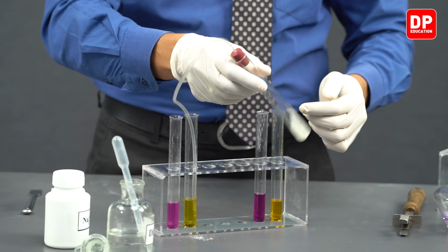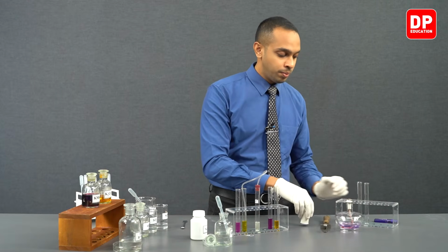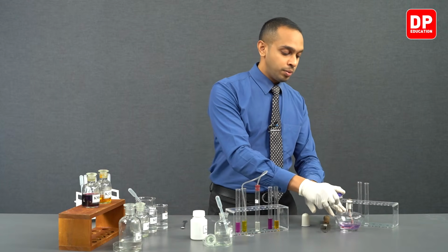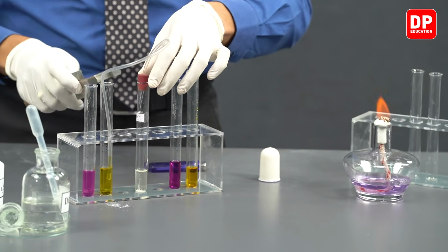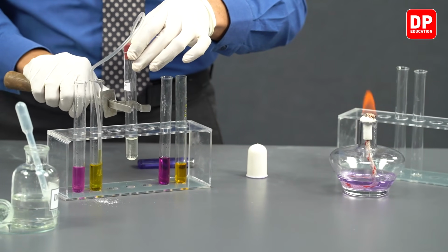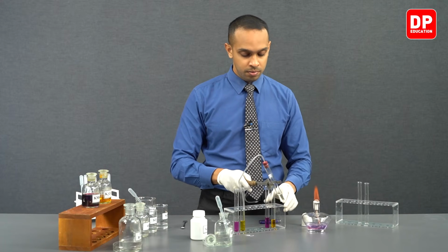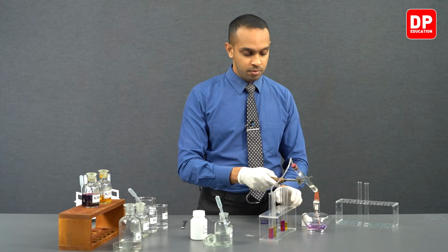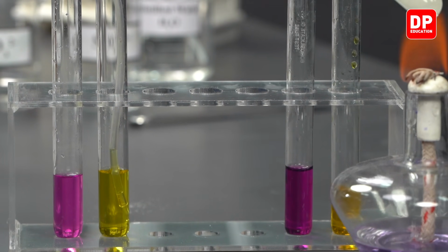If sulfur dioxide is not getting produced fast enough, we can always heat this setup with the use of a spirit burner. You can see as we heat it, more and more sulfur dioxide gas is produced.